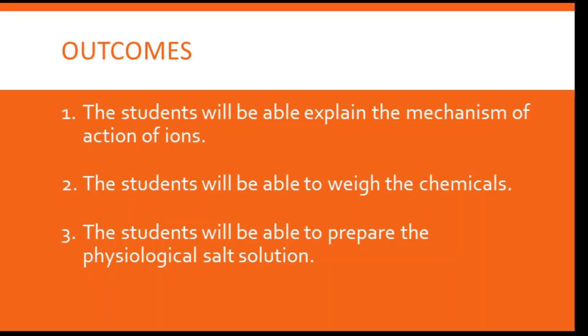Outcomes of today's practical: the student will be able to explain the mechanism of action of ions. The student will be able to weigh the chemicals. The student will be able to prepare the physiological salt solution.